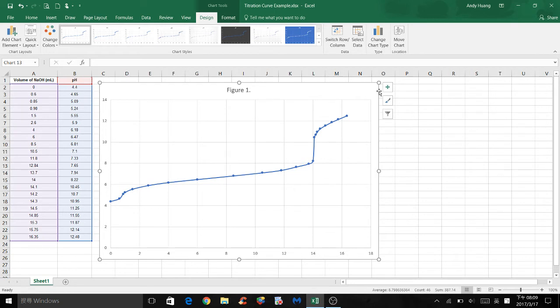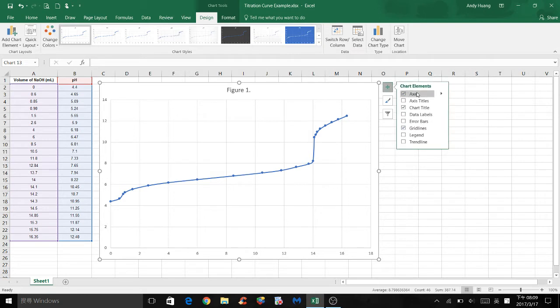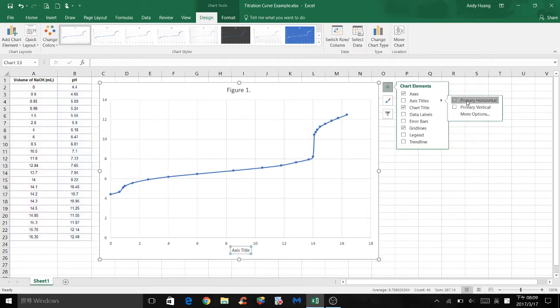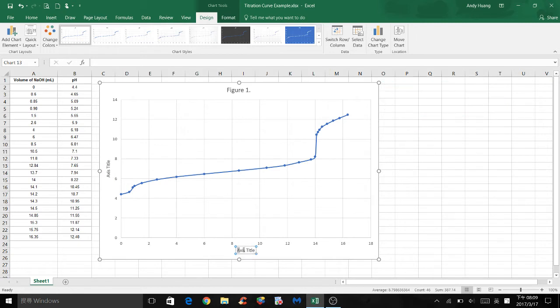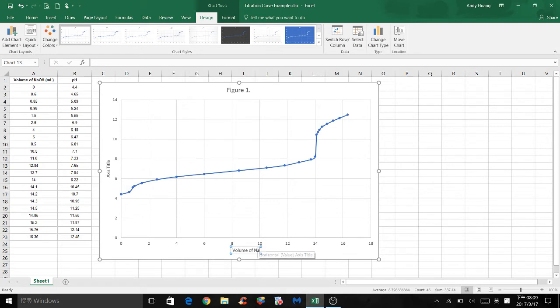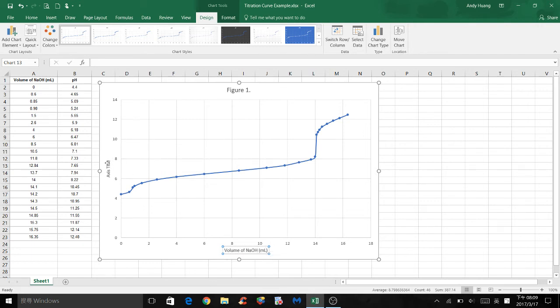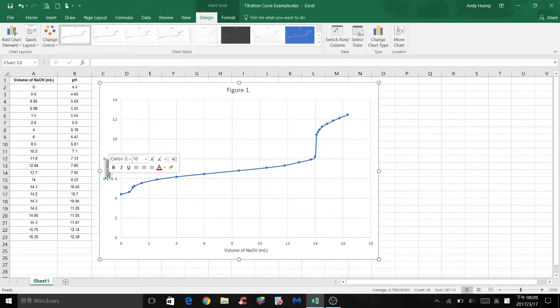To do that, select chart elements next to axis titles. Check the boxes for primary horizontal and primary vertical. The x-axis in this case is volume of sodium hydroxide, and the unit is in milliliters. The y-axis is pH.